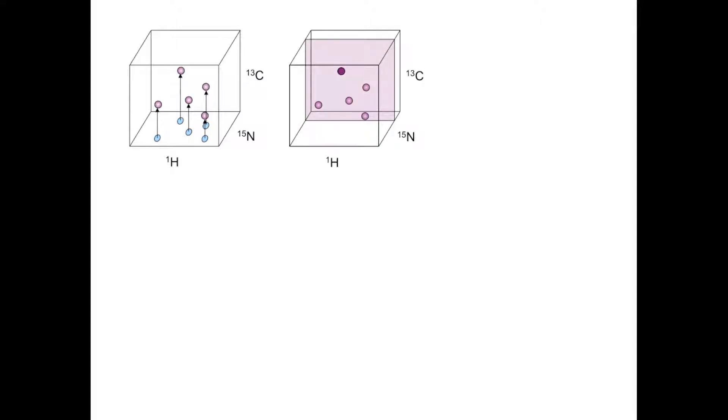In each plane you'll see a different peak. The way shown here, we have protons along the x-axis, carbon along the y-axis, and planes taken from different points along the nitrogen z-axis.